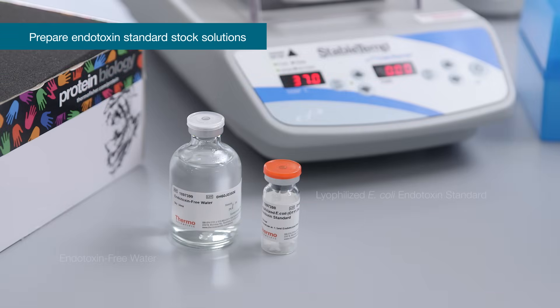Each lyophilized E. coli endotoxin standard vial contains 10 to 50 endotoxin units known as potency.